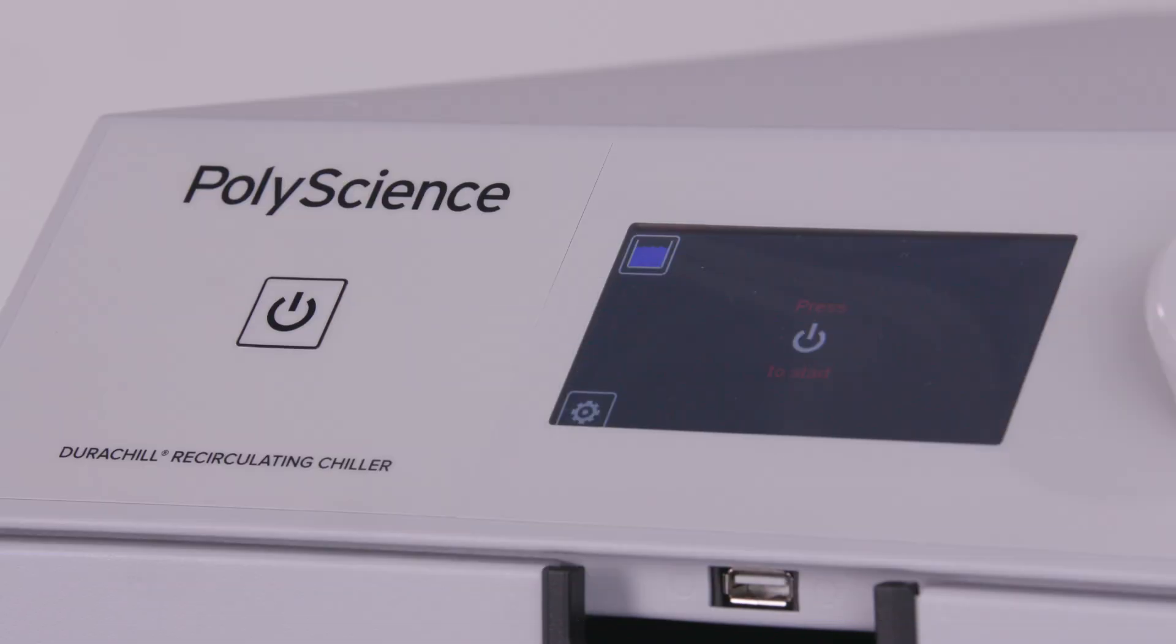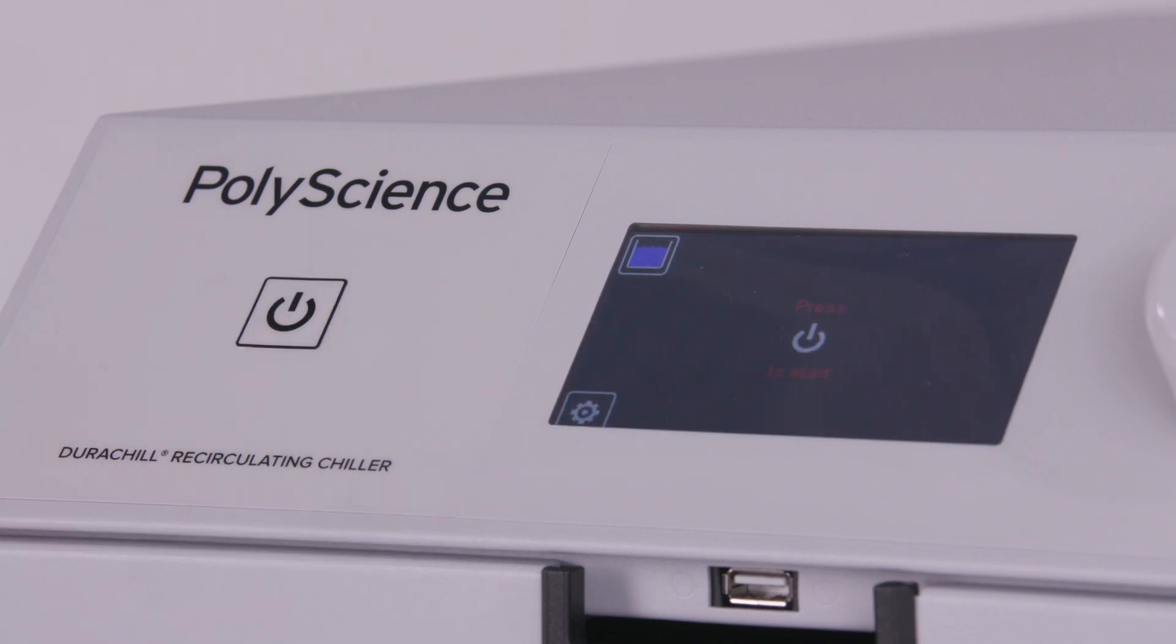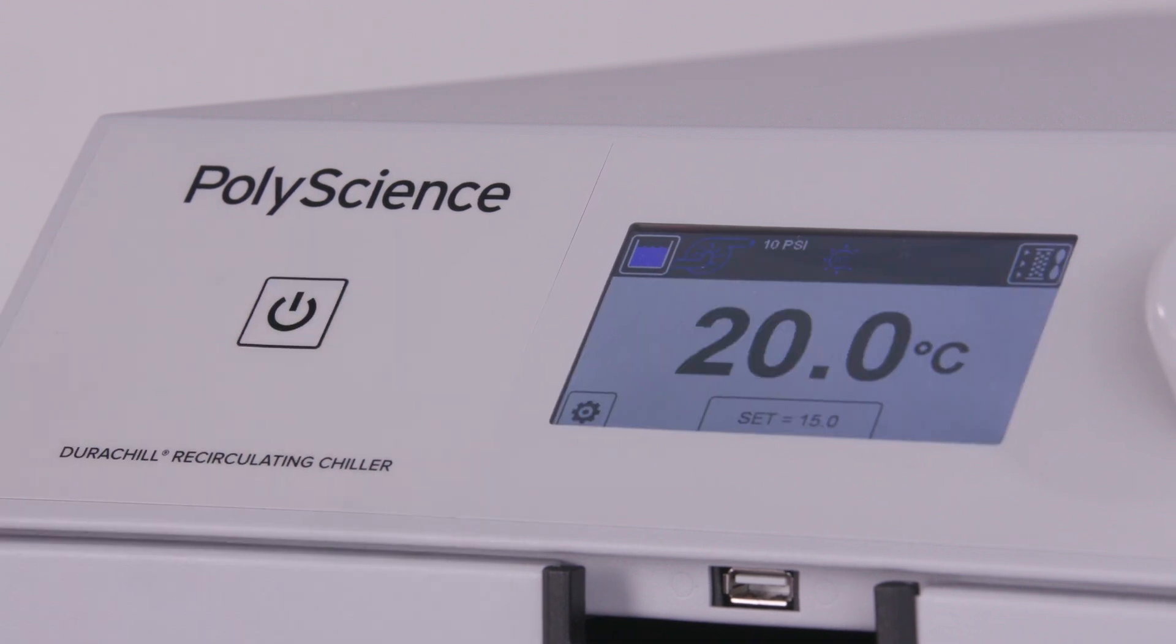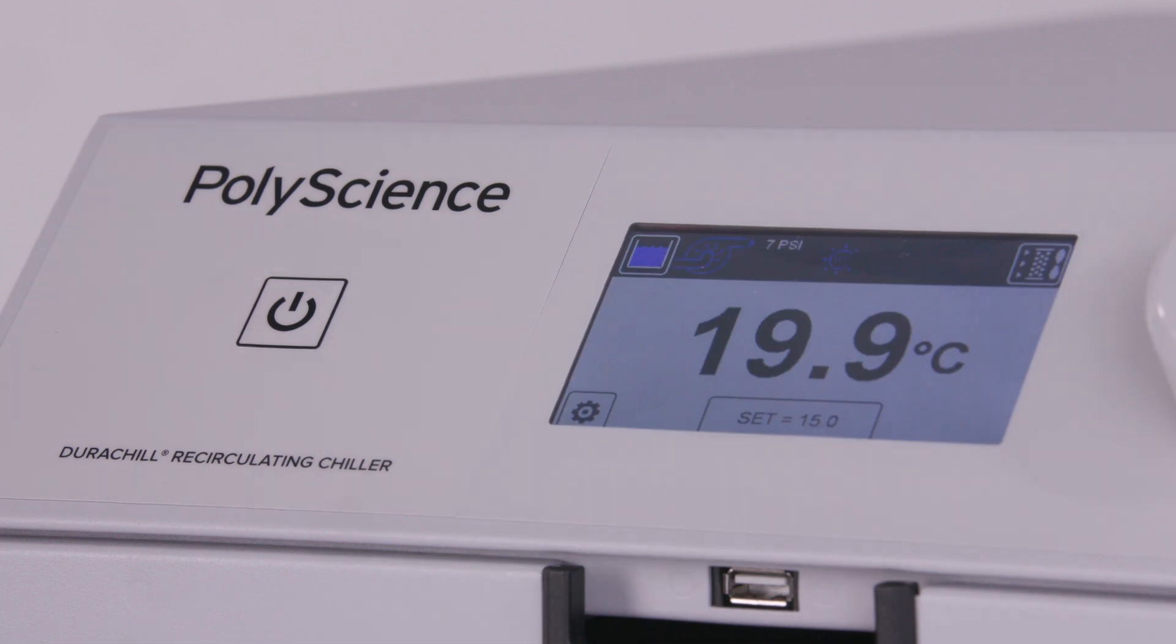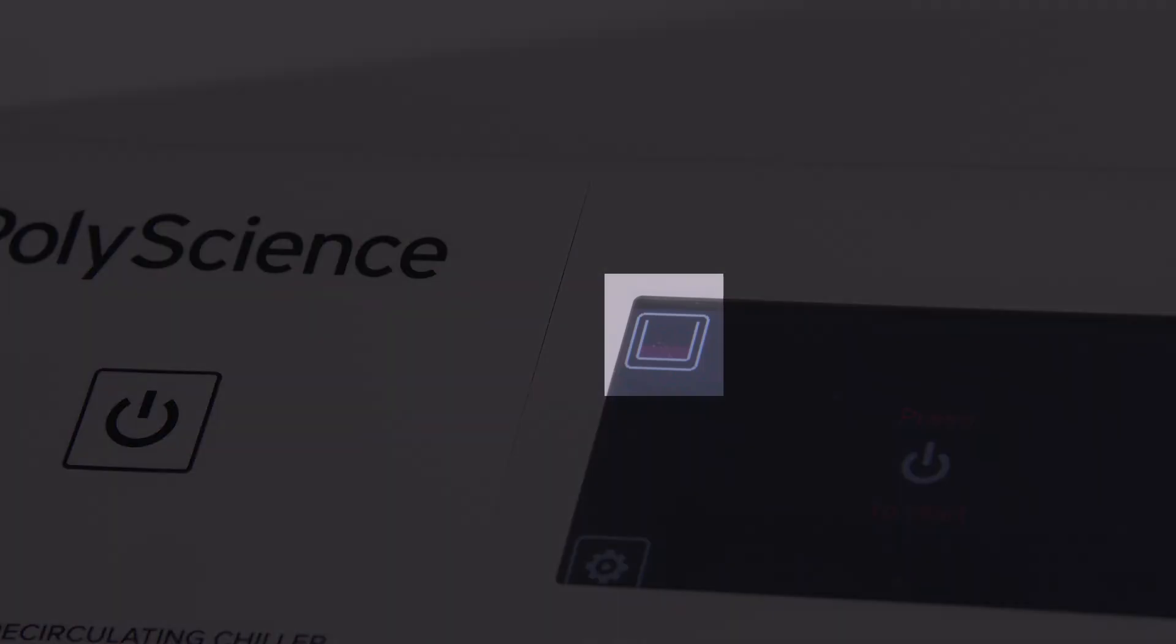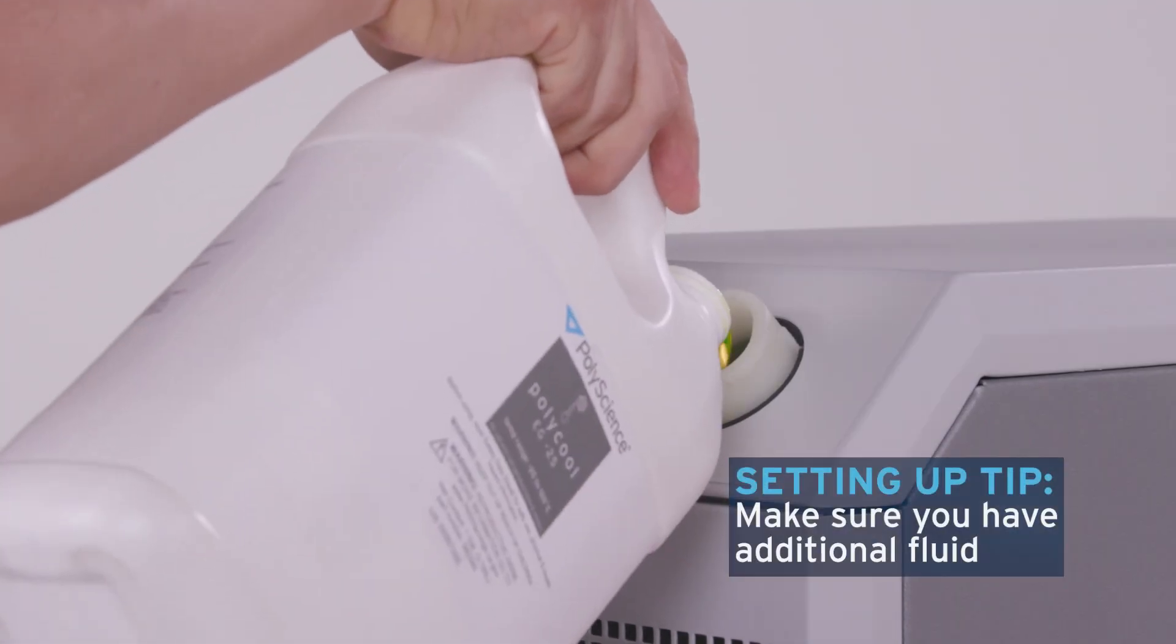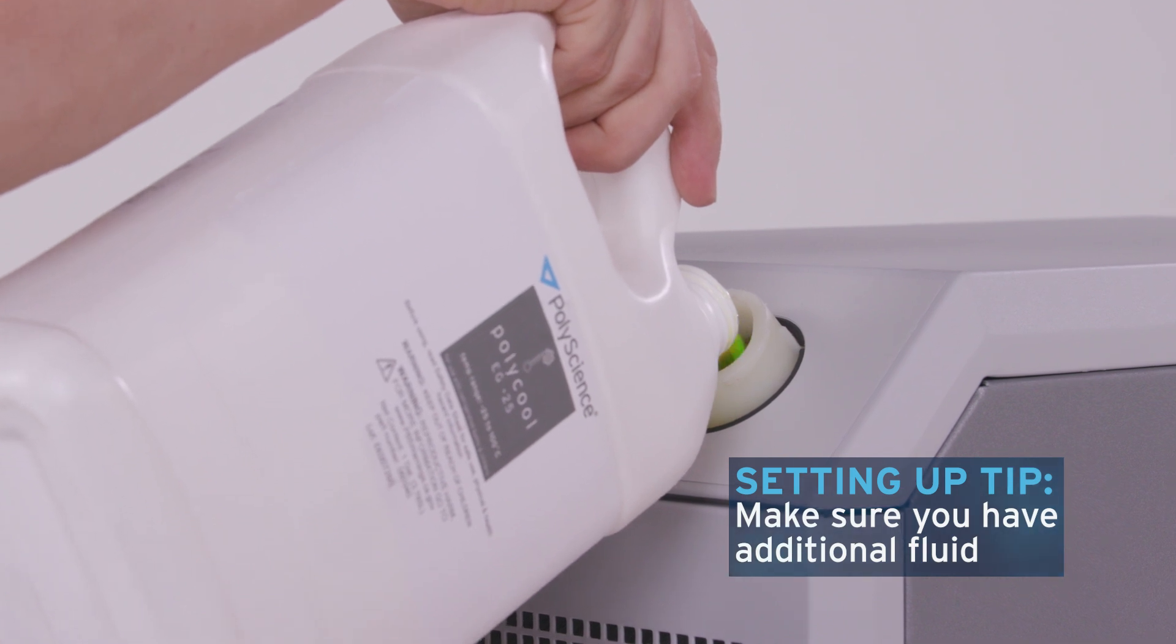Prime the pump by turning the unit on then off three times. This purges the air from inside the pump. As the process tubing fills with liquid, the liquid level in the chiller's reservoir may drop. This is normal and may occur more than once. Refill the chiller's reservoir as needed.